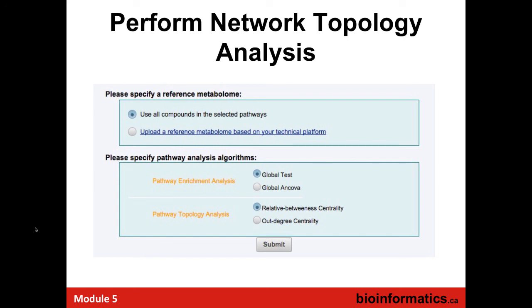So different options, yes. Do we need the names of the components for this as well? Yes, you would want the names, although you can have arbitrary names. But if you have too many of them, it won't see any pathways because you're looking at KEGG. So if you've got 80% of the compounds with names and 20% which are unidentified, then maybe you'll be able to get some pathway analysis. It's not going to map the unknowns to anything, but if you think it's useful. But in the end, you've got to have a good number of compound names, and you need to have some relative concentration or absolute concentration data that helps distinguish things.